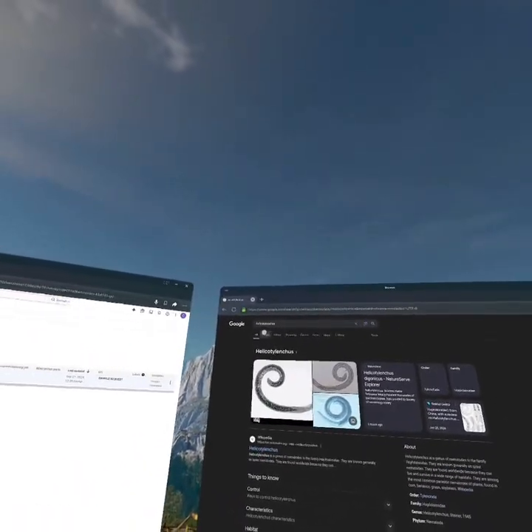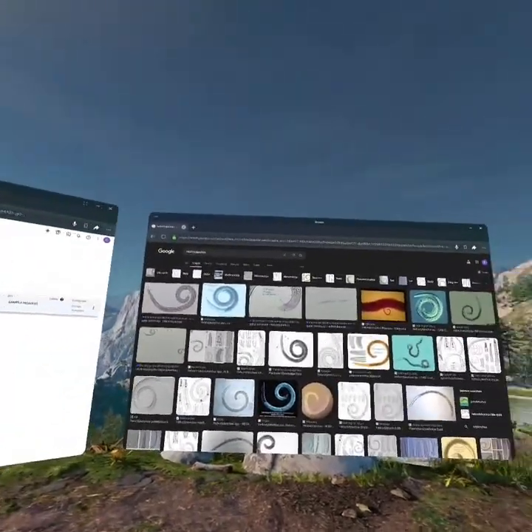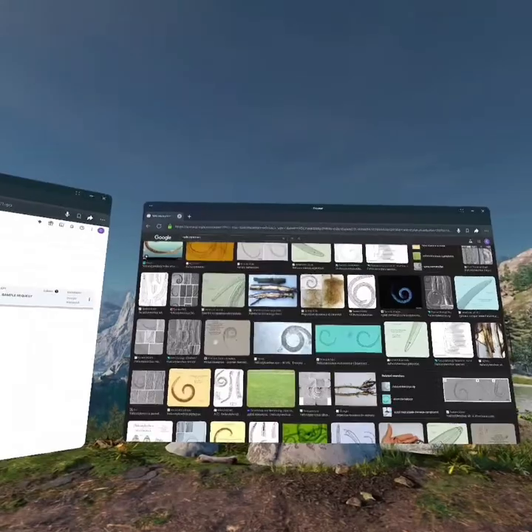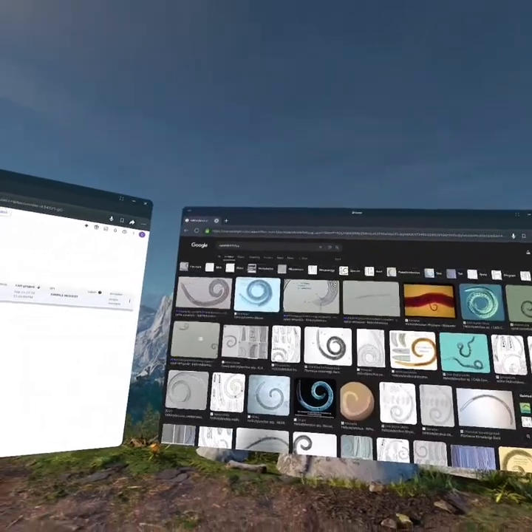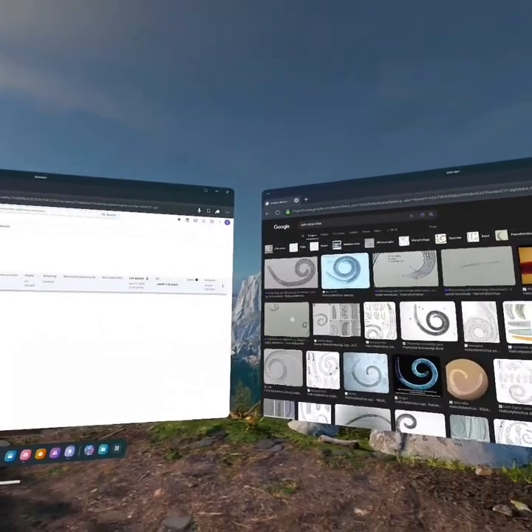All right, let's go to images. I'm just going to pick some images at random. I really want to use one that has multiple nematodes in it. There's a good one. Oh, Meloidogyne in there. So we'll do those two. First, let's start with this one.